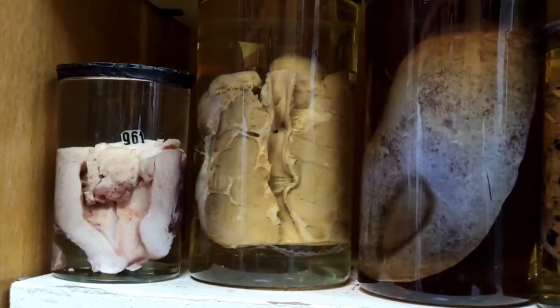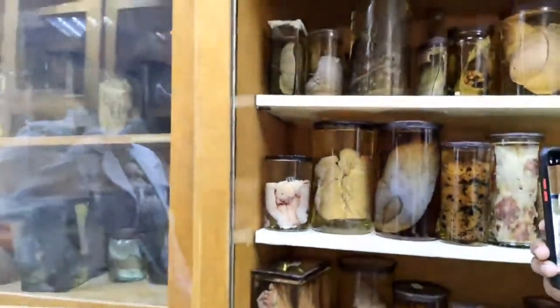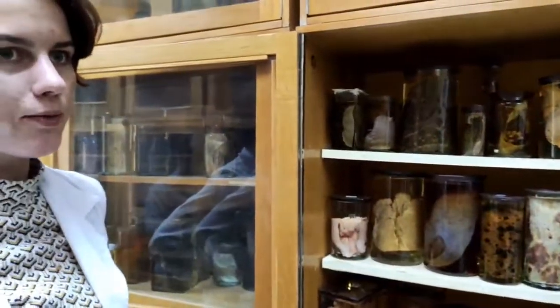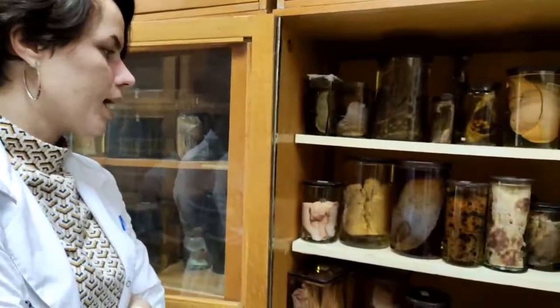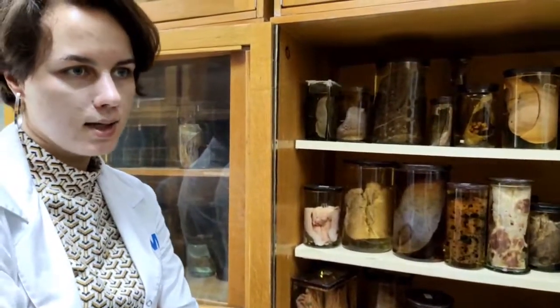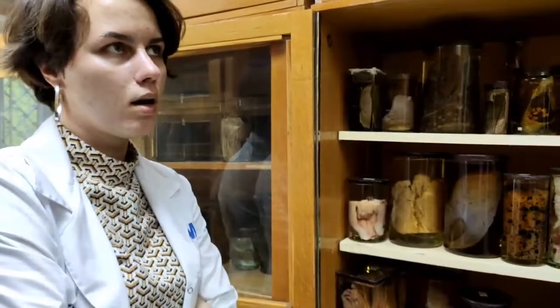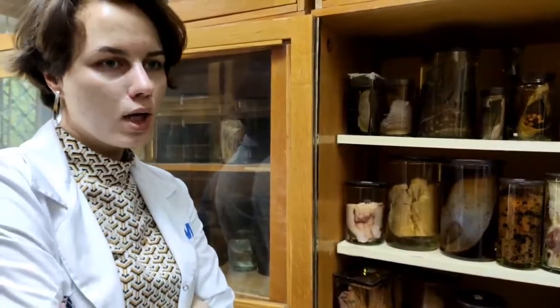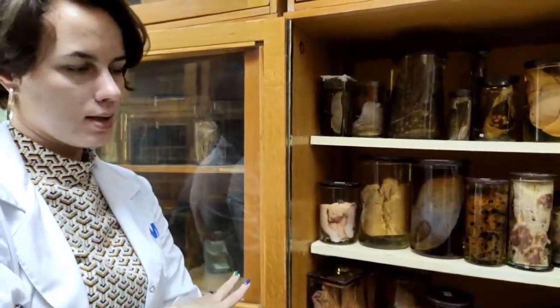So you should know that this is also a malignant tumor from lymphocytes, from B lymphocytes, because we have B and T lymphocytes. I guess you had a lecture about lymphomas, and when you're talking about Hodgkin lymphoma, you should know that there are diagnostic cells. They are called Reed-Sternberg cells. There are other types of cells, for example, popcorn cells, which are Hodgkin cells, lacunar cells, but the main and the most important cells are Reed-Sternberg cells.